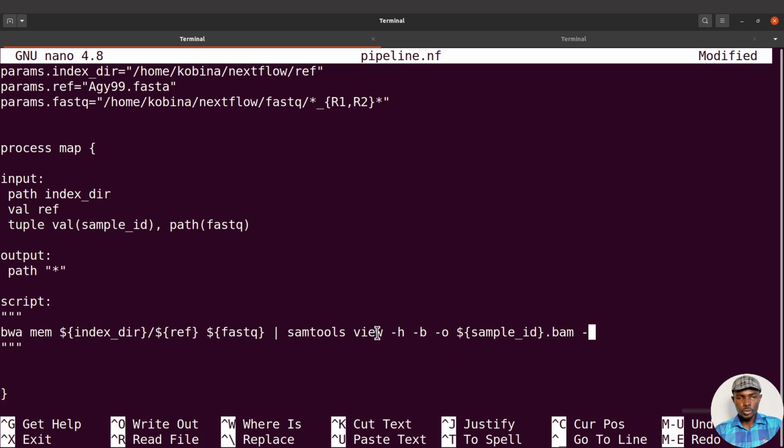All right, so samtools will convert the information to a BAM file, which will save. There's the sample name here. So that's it. All right. So with the sample ID, yeah, I keep on mixing them up. It's the same thing, by the way. So the sample ID or sample name, if you want to call it that way. So the sample ID, we already specified it here.